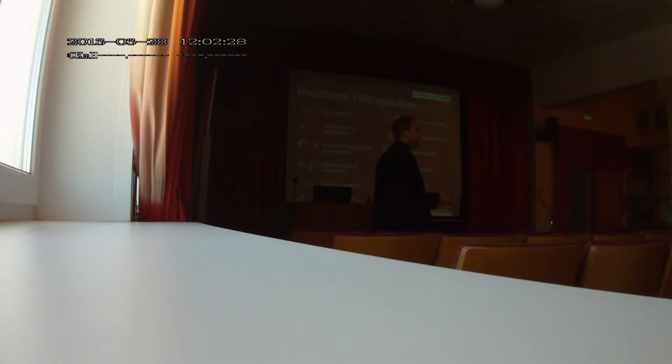There are a couple of genetic applications like fluorescence in situ hybridization. It's possible to look at parasite applications, or some people use it for oceanography. They look at the morphological differences between the microflora in the coastal waters, and based on this they identify the specific subtypes of the microflora, and based on that they assess the quality of the coastal water. So there are really many applications.